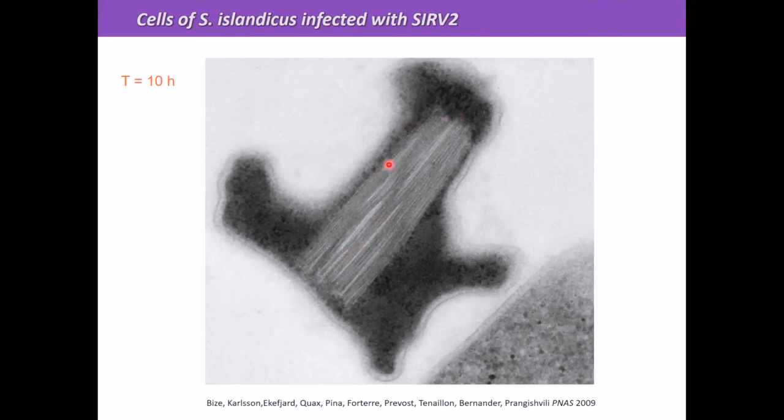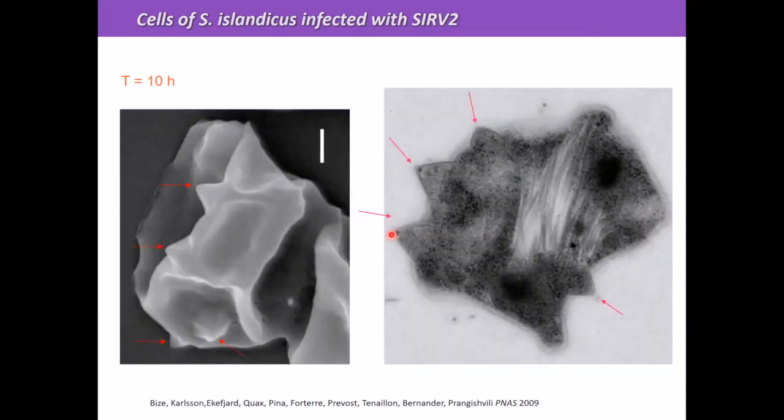to assemble new virions, which you can see here, and then they have to be released. And this virus does it in a remarkable way. It builds virus-associated pyramids on the cell surface, which you can see here in the thin section of the infected cell, these large triangular things right at the cell membrane.